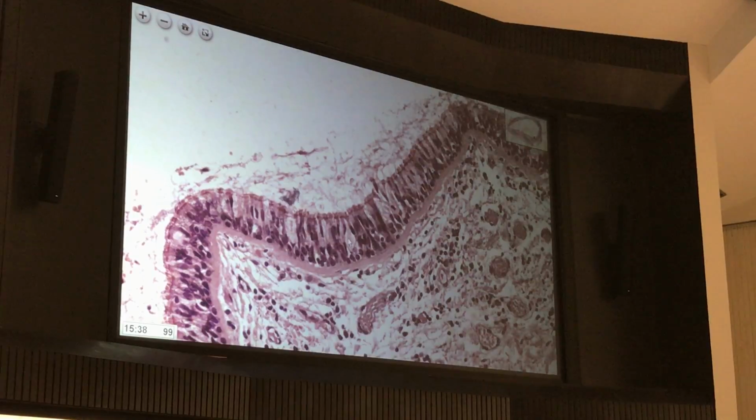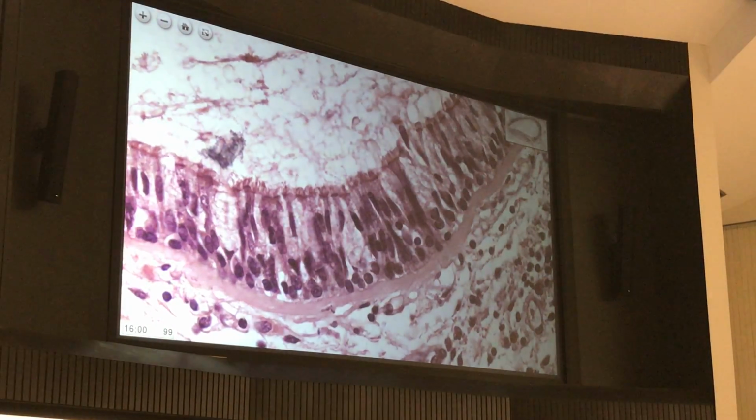It's pretty thick, and students will ask sometimes, why is it so thick? And I really don't know. One of the thoughts is, what are we doing? We're breathing in a lot, so it's kind of a barrier. We want the gases to go and exchange at the level of the alveoli to get into the bloodstream. So it might just help impede the diffusion of things.